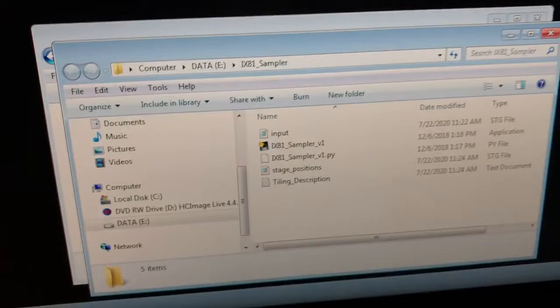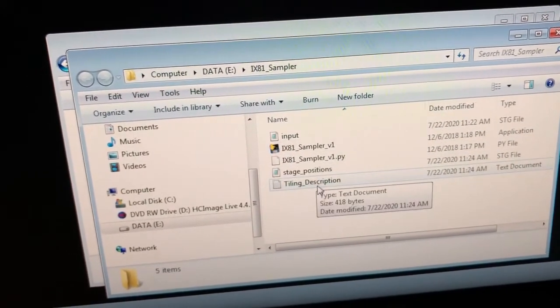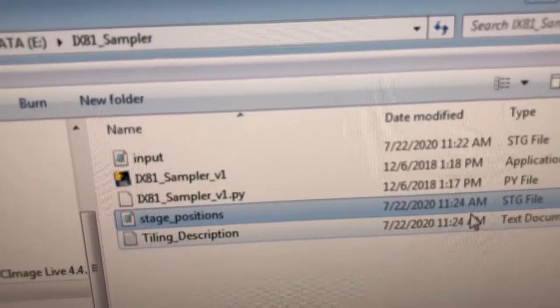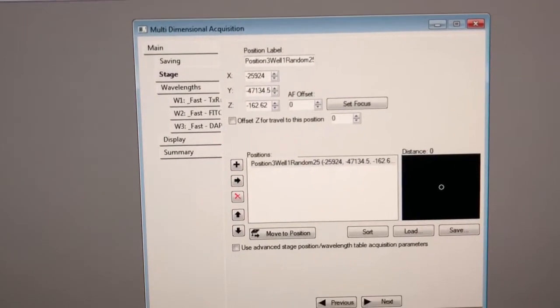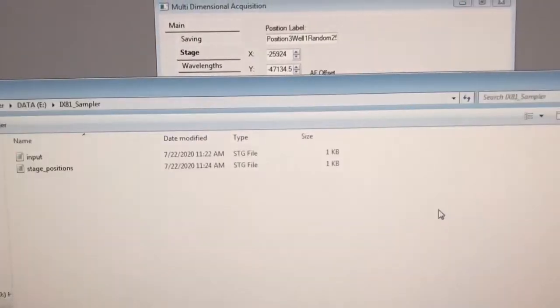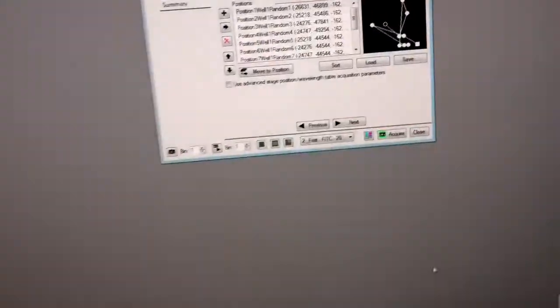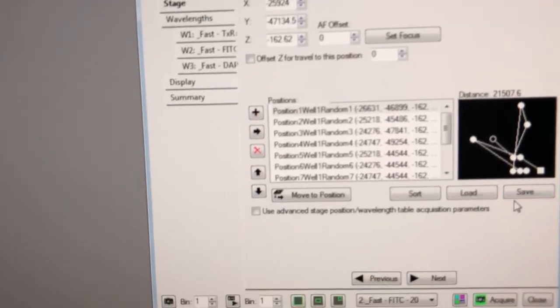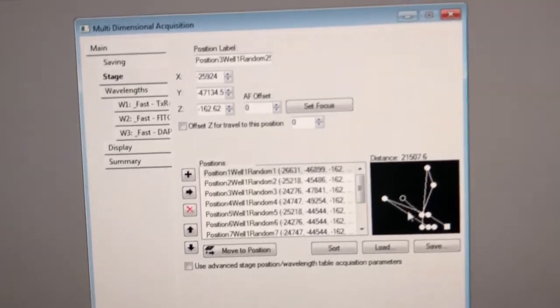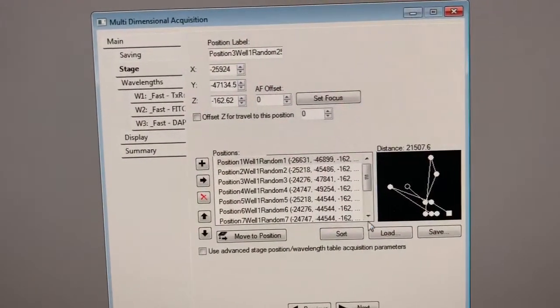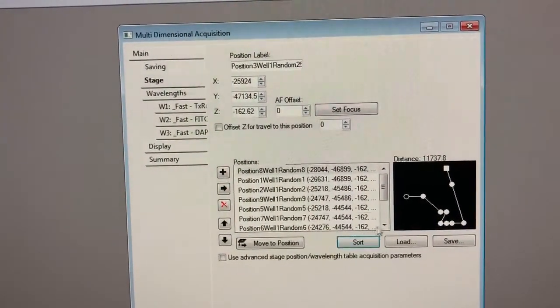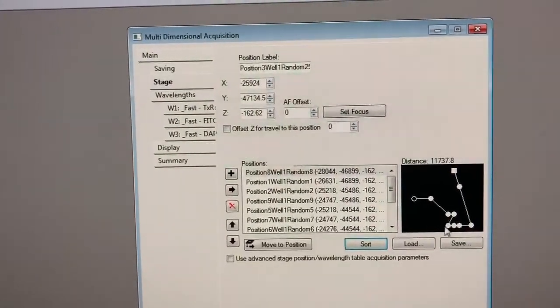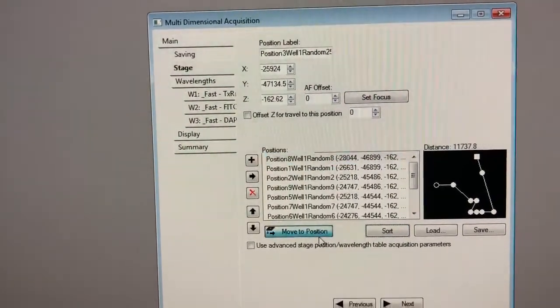Okay so it's done. What it did was in this ix81 sampler folder it created a new file called stage position. So that timestamp is the time at which I'm recording the video. So it just made that file. So now if I go back to metamorph and I go back here to stage tab I can say load stage positions open and you can see those are all random positions. Since they're random they're in a sort of non-optimal order for visiting everybody so you can sort them by pressing this button and now we will be able to go to them in an order that minimizes the travel time. So let's go to the first one say move to position.